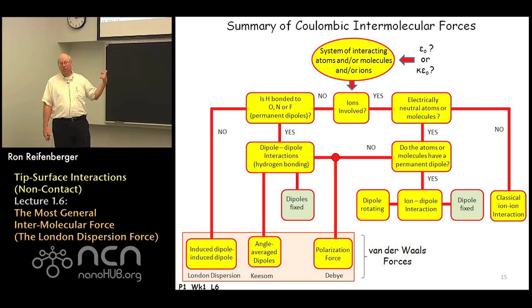There have been explicit equations that have been derived, and that allows you to estimate the interaction potential energies for a wide variety of different ions and molecules interacting one with respect to another. This flowchart diagram just tries to summarize everything we've discussed in the previous week. In particular, I call your attention to the light orange colored box on the bottom.